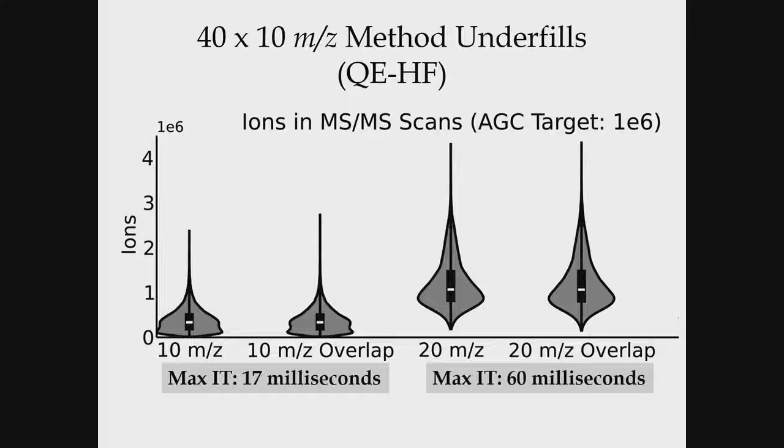And a key component of this is very different than doing DDA, because most of our time is sampled where we would not necessarily have triggered an MS event, because the MS1 signal may be very small in that isolation window, even though there's actually a decent number of ions.